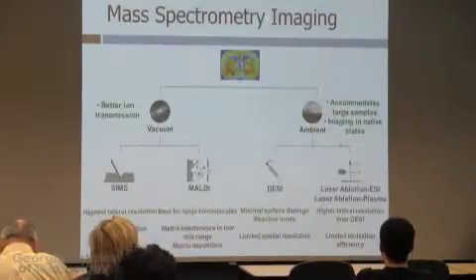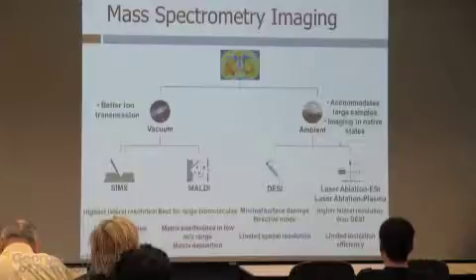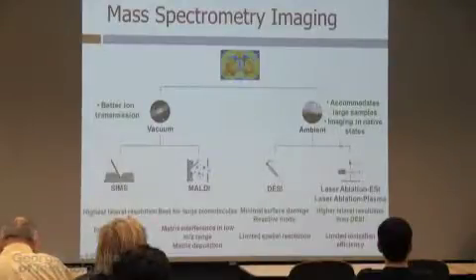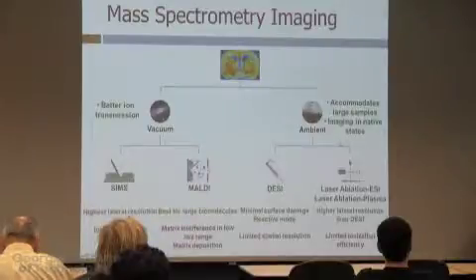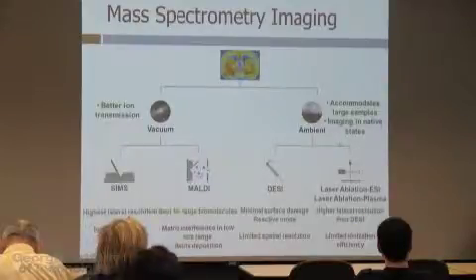There are many ways of doing mass spectrometry imaging. Our core facility here in IBB is very good at doing MALDI imaging. MALDI is a technique that works with a laser and a matrix. The laser shoots on the tissue sample, and for every spot you get a mass spectrum. If you raster the laser, then for every spot you get a mass spectrum, and then you can say, build me an image for m/z 452. It's a virtual image. It's not really an image, but it will plot that mass over X and Y. You can do that routinely these days.